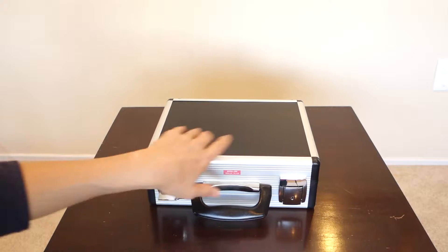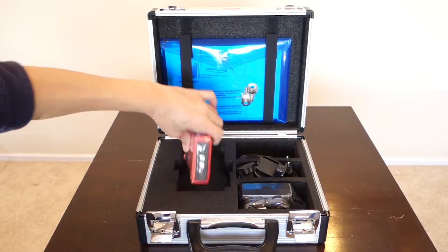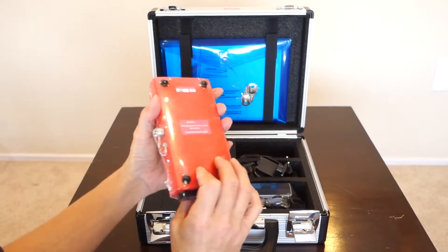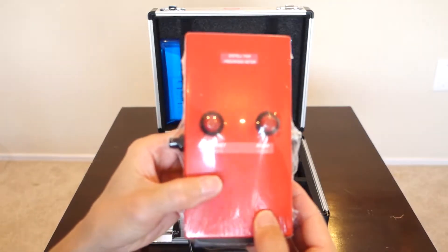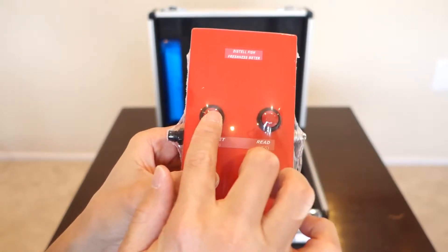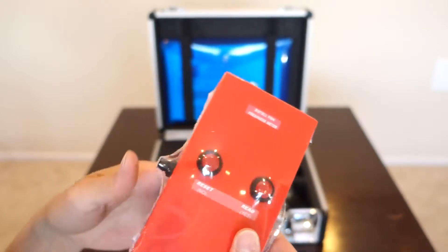Let's open it up and see what's inside. Right away you see the actual Torimeter here. I'm going to take this out. It's still brand new — I haven't opened this up myself. As you can see, it's red, very small, and very light. It's got these two buttons — a reset/no button and a read/yes button — very easy to press. It's labeled 'Fish Freshness Meter,' so right away you can tell what it is.